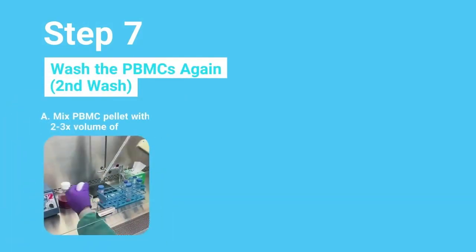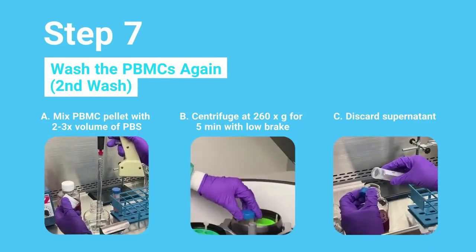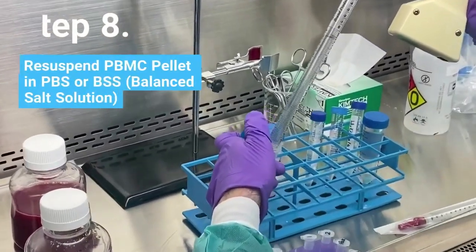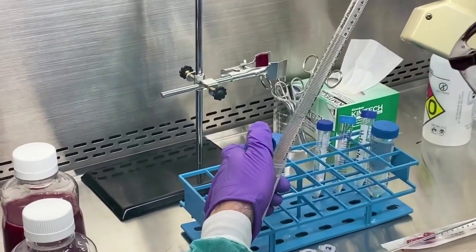Wash recovered PBMCs a second time in PBS to remove any remaining contaminants such as platelets and density gradient media. After the final wash, remove the supernatant and suspend the PBMC pellet in an appropriate amount of PBS or BSS for cell counting, cryo storage, or your specific experimental requirements.